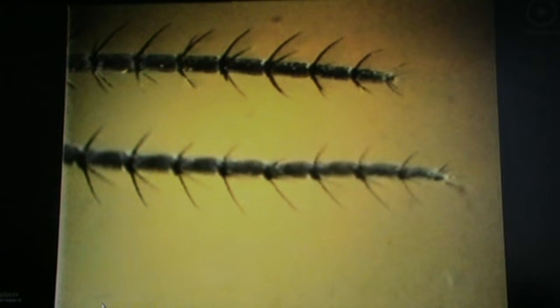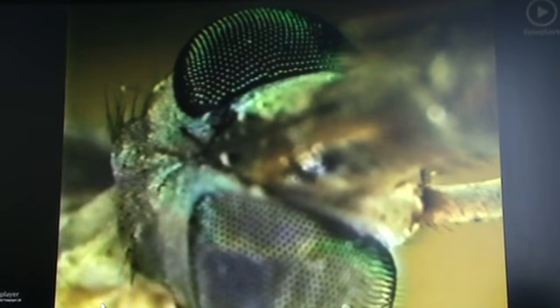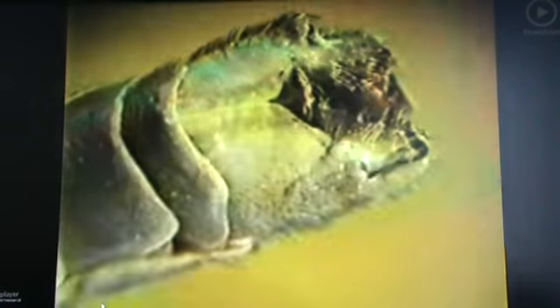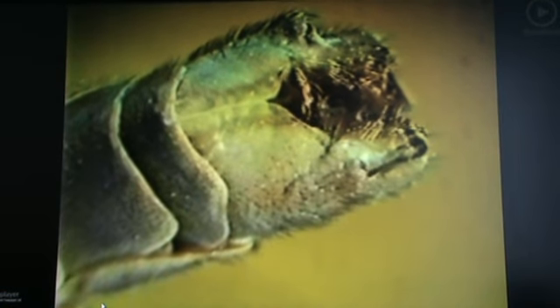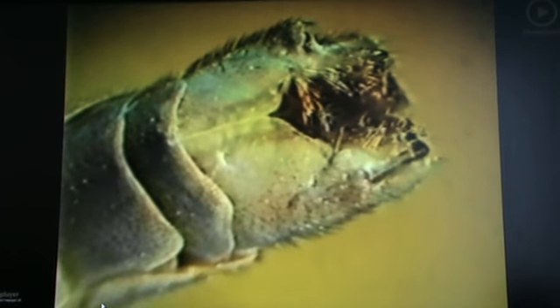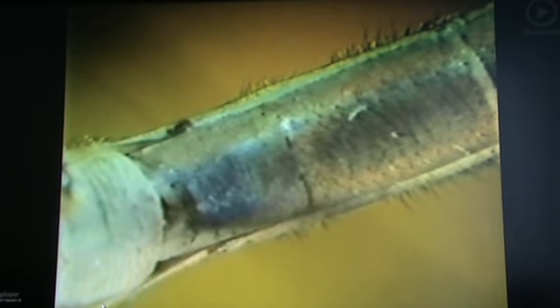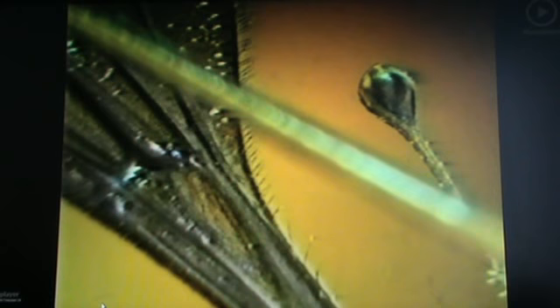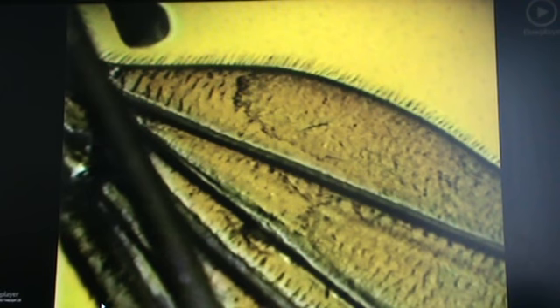The legs and the leg joint fracture section, the haired tentacles, the big compound eyes, the mouth and anal regions, the lateral segmental breathing holes, the vibrating bodies used for flight stabilization, and the wing structures in the finest detail.